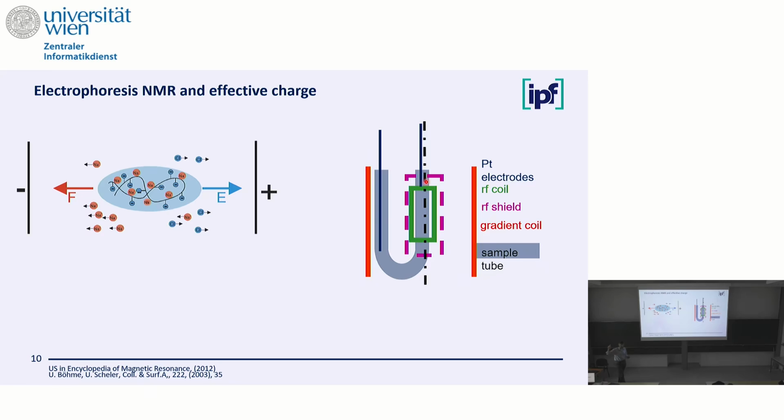It can be a molecule with condensed counterion, solvation shell, it can be complex. And counteracting, we have the hydrodynamic friction. Hydrodynamic friction is proportional to the velocity, so I can only accelerate until I have this force balance. From the force balance and some of the experimental parameters, I can work out the effective charge that is moving in that electric field.